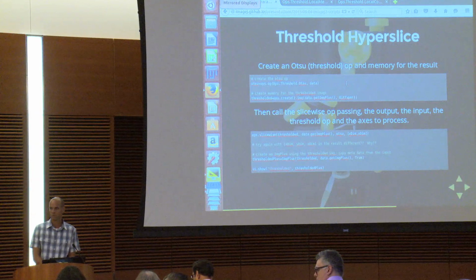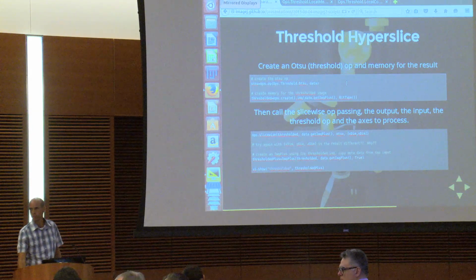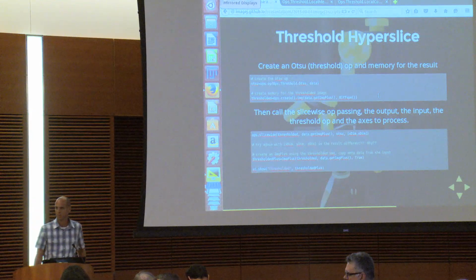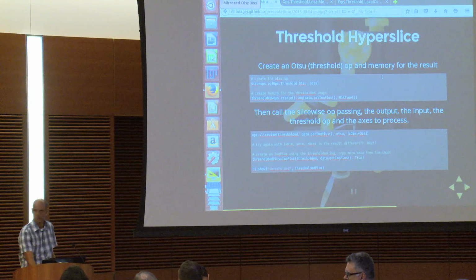There may be other parameters involved, but those are secondary. Even with something like adding a constant to an image, the image is the first-class thing that I want to work on. The fact that I'm adding a constant, I just fix that constant. It's sort of like the difference between independent and dependent variables. What you want to do is loop the same op over multiple inputs, and defining whatever the special input is makes a big difference for the structure.